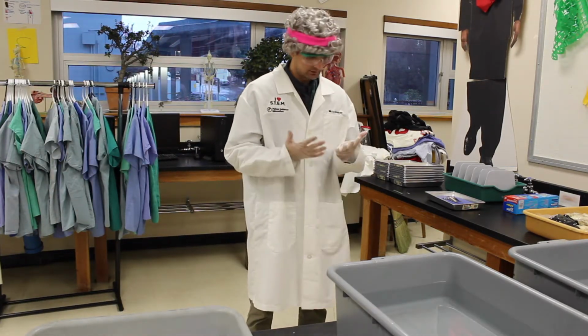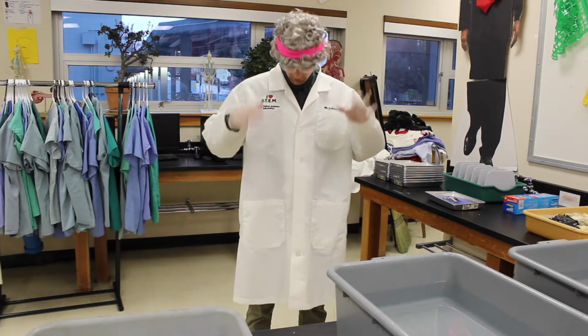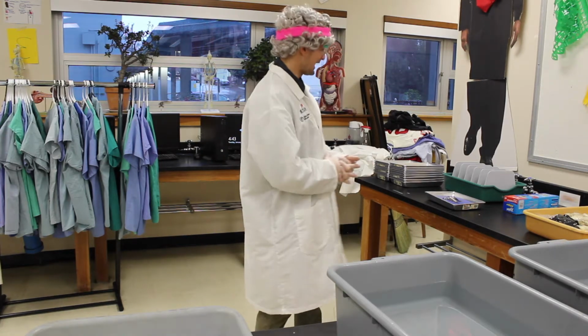Alright, welcome to episode 2 of Mr. Mundahl's World. So, you want to make sure you have your PPEs on, goggles, gloves, and your lab coat so you protect yourself. So we're going to go over cleanup for our lab today.